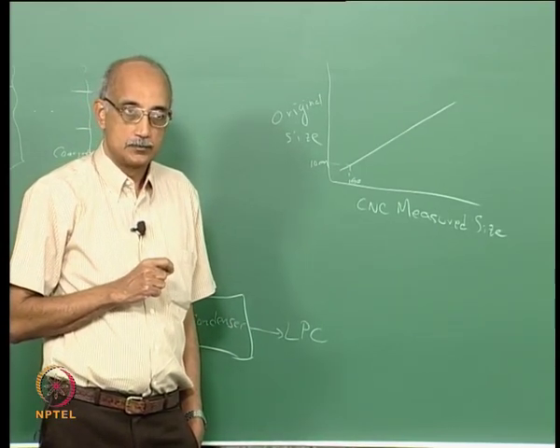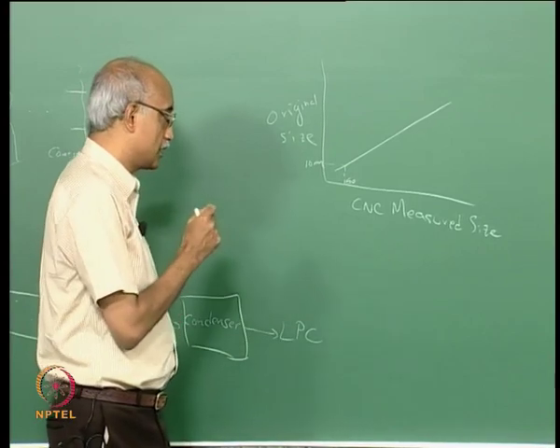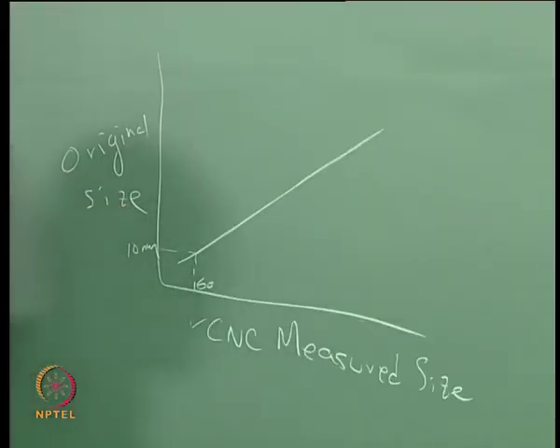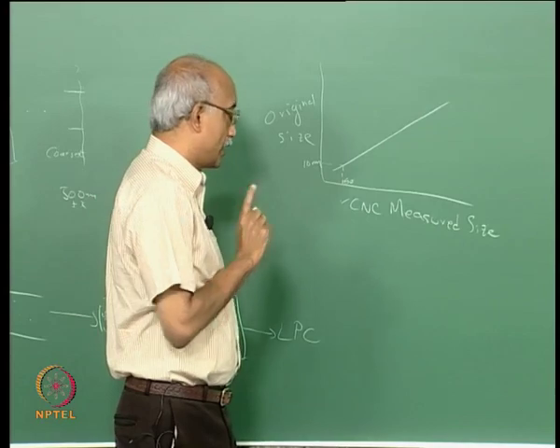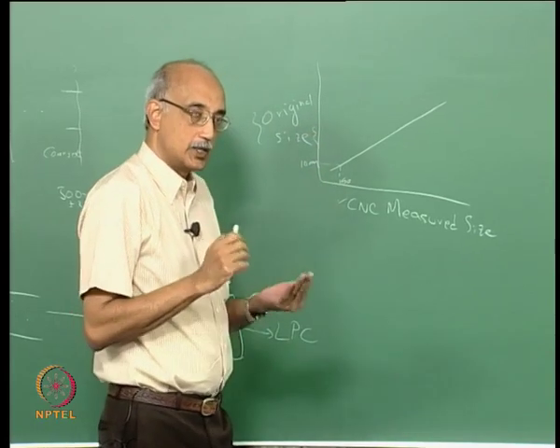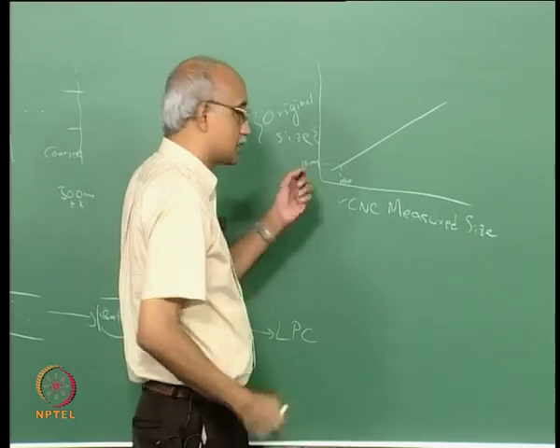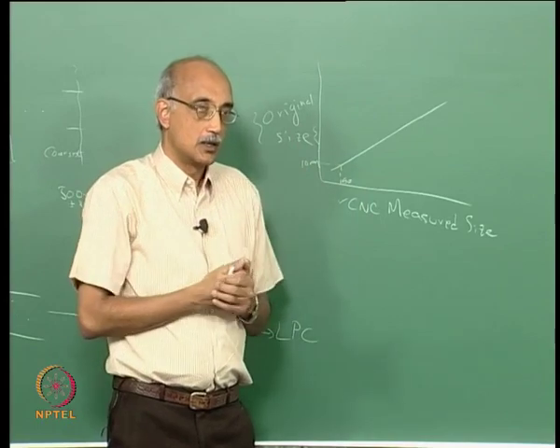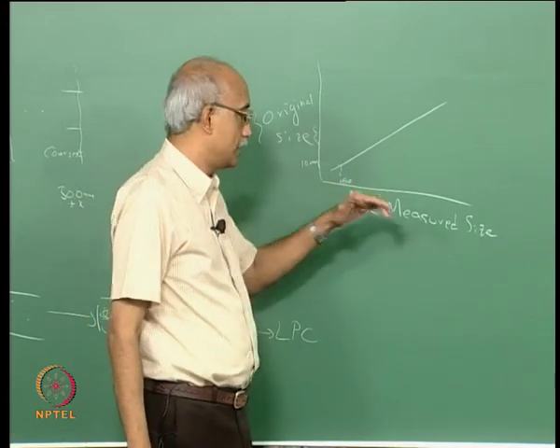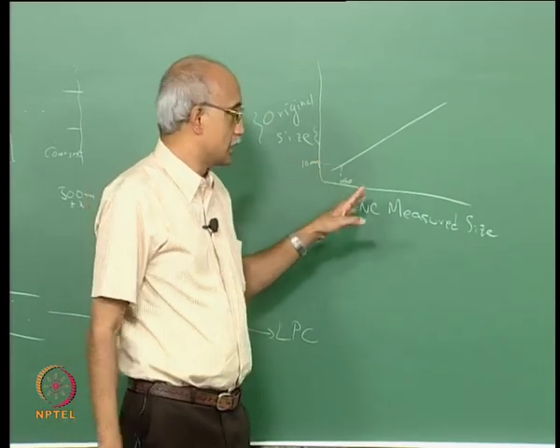Yes. So how is the calibration graph drawn, sir? Well, again, there are really two ways to do it. The calibration can be theoretical, because what you're really measuring is only this, right? And you're still estimating this. But you can actually theoretically calculate what this size was. In other words, because you know the mobility of the particle as a function of its particle size, you know that particles that are captured in the first mesh have to be within a certain size range, and therefore you can establish what the size is. Similarly, for each of the measured sizes, you can theoretically calculate what this is and develop this line.